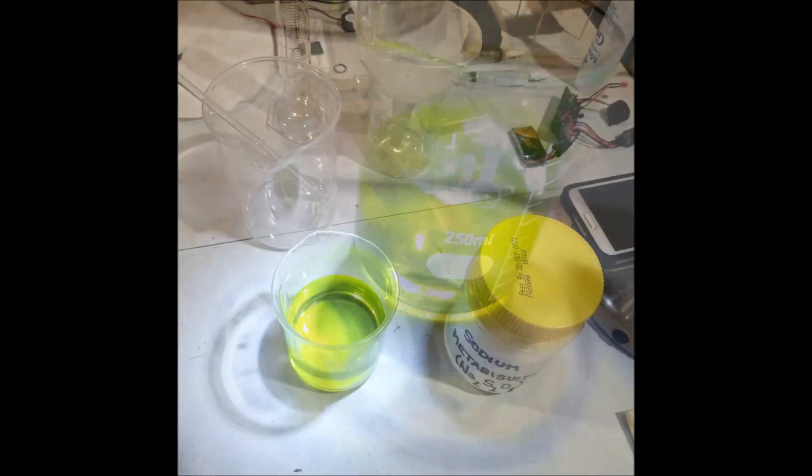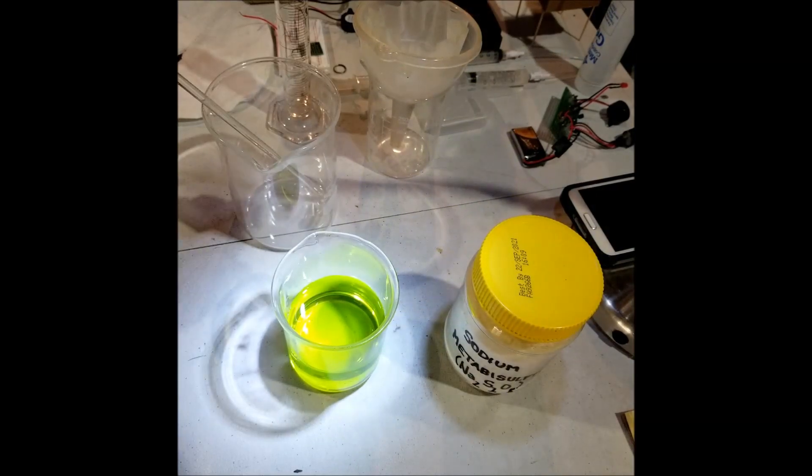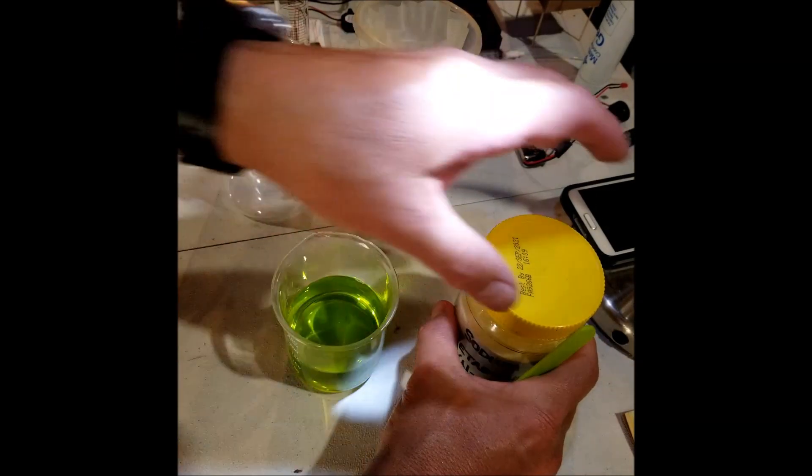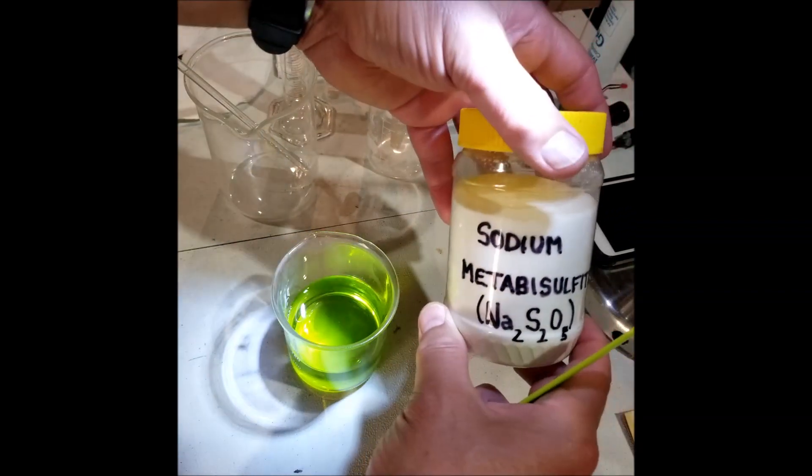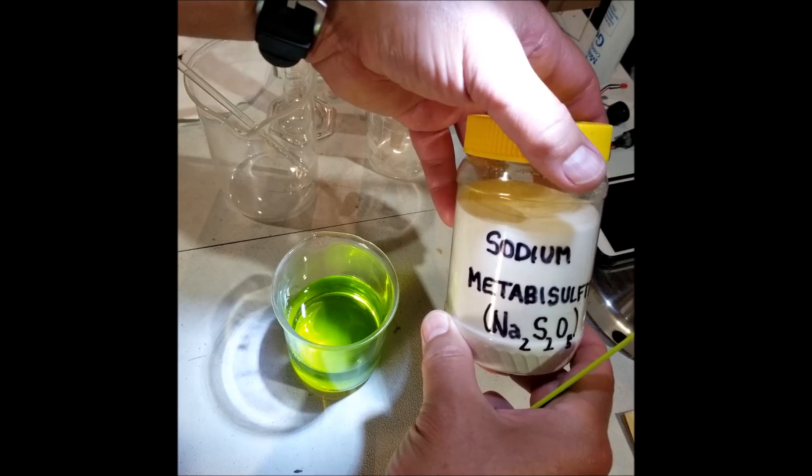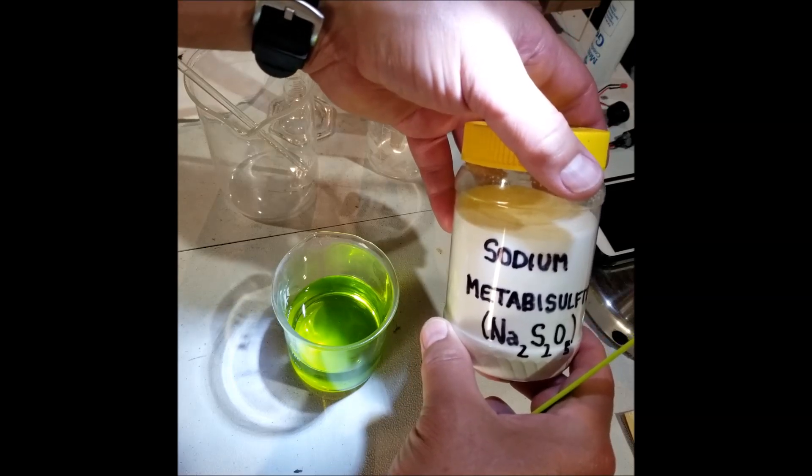We are almost done. Here we have our final solution. We're down to one of our last steps here, and you're going to see something called sodium metabisulfite. This will work with the gold to bring it out of solution back into a metal.